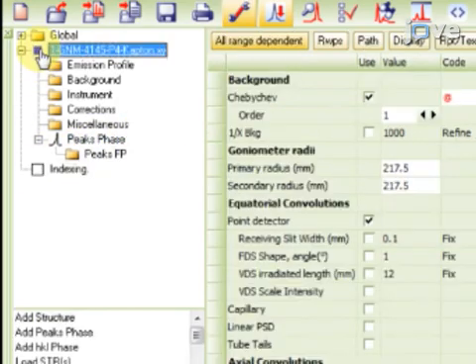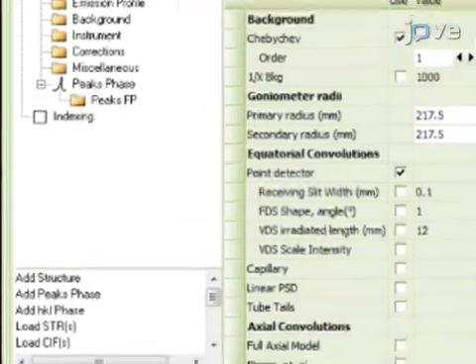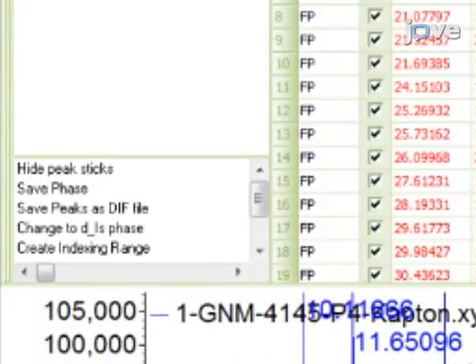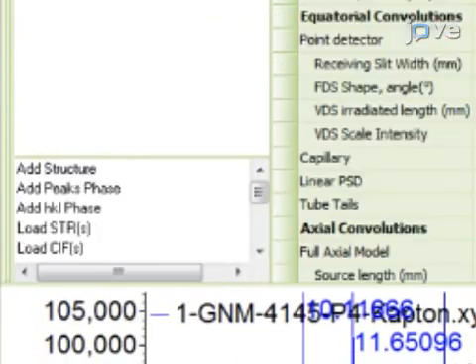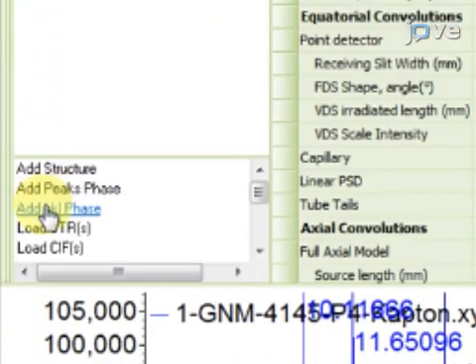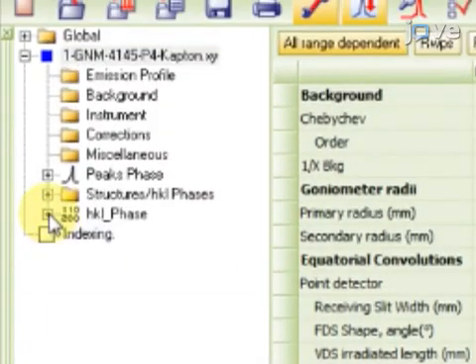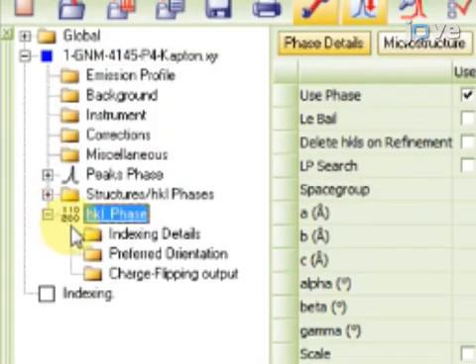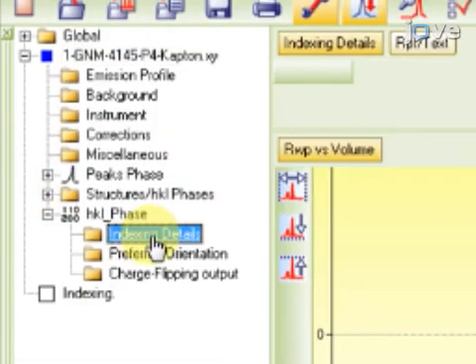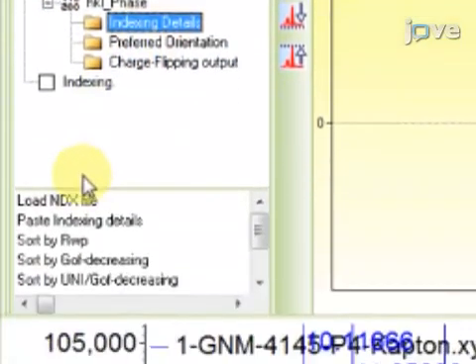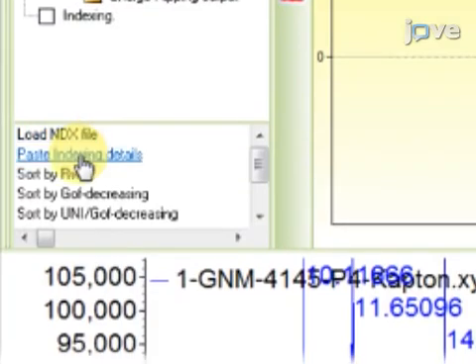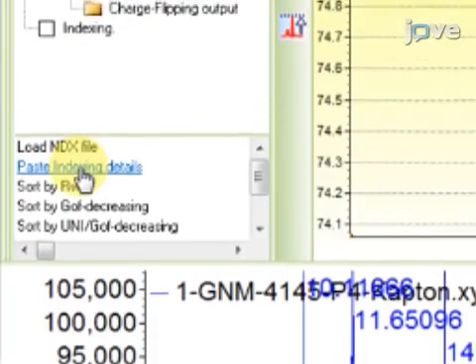Deselect Range Indexing and then select the range. At this point, press Add HKL Phase. Expand the range, and then expand HKL Phase. Under Indexing Details, choose Paste Indexing Details.